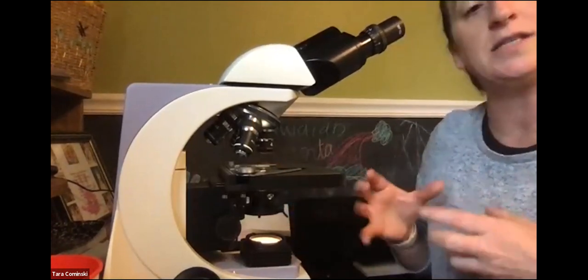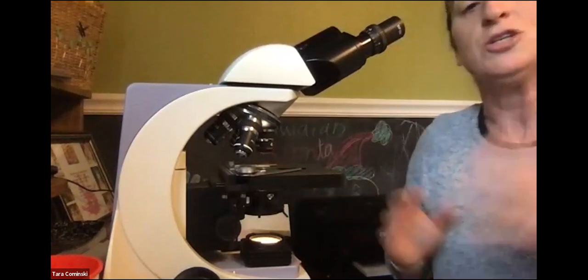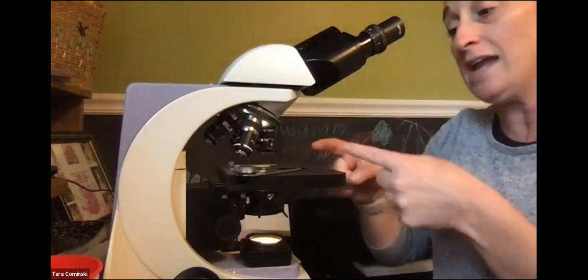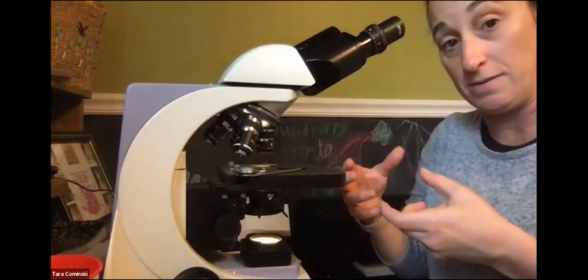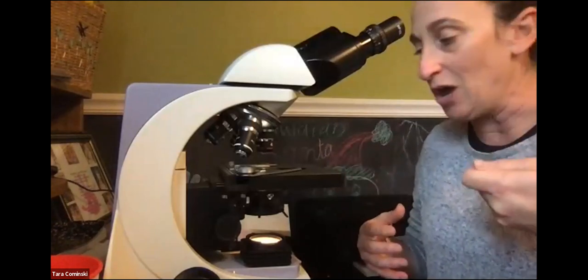The other thing to keep in mind, because this will be part of the inversion part, just so I don't have to tell you again or show you again: I put the slide in, and it looks like a lowercase e, like you would normally see a lowercase e, okay? When you look in the microscope, it's not going to look that way. All right, so let me show you.